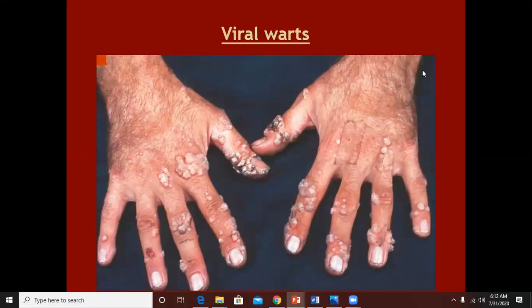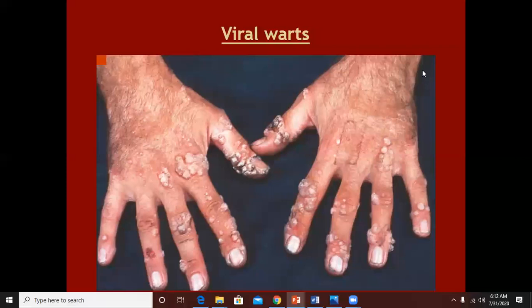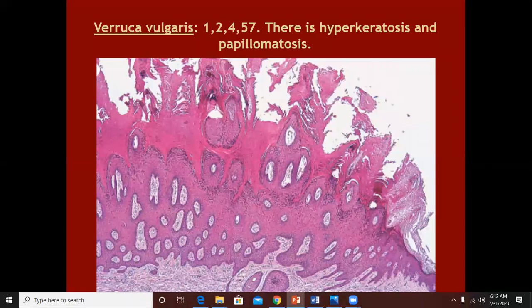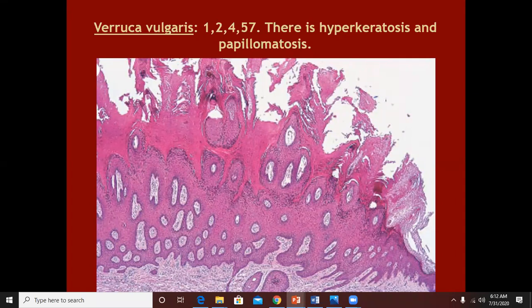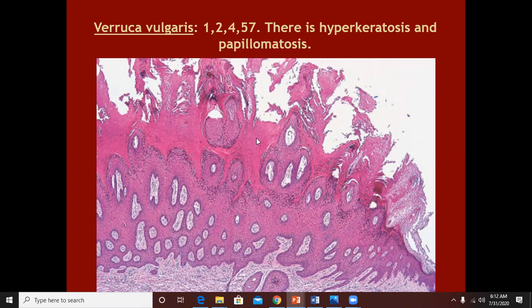Viral warts present in different forms. These are the common warts or the fairly formed warts. The most prominent histopathological finding, starting from the top, will be hyperkeratosis and acanthosis — meaning the stratum corneum will be thickened. That's why warts are called hyperkeratotic lesions.